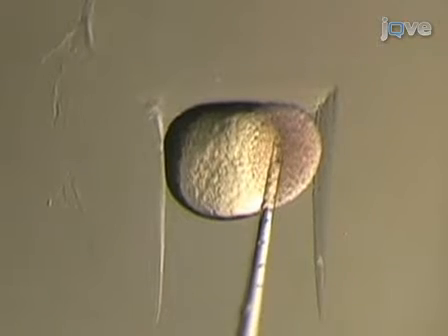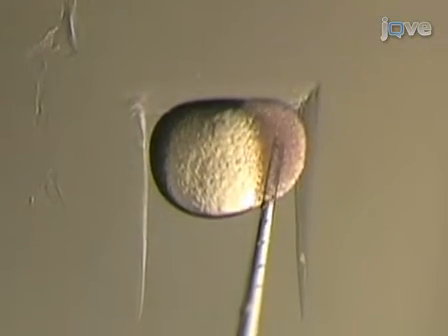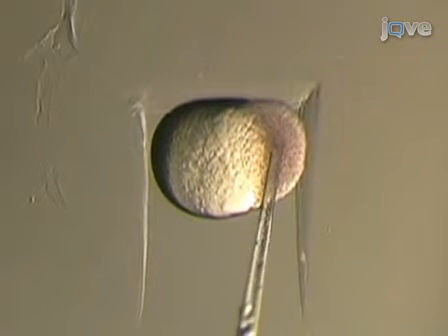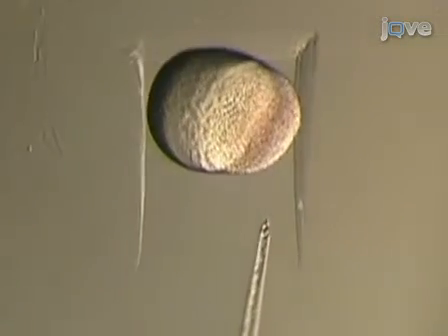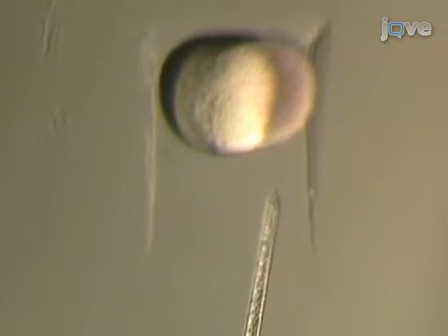Draw up donor cells slowly and carefully into the needle to avoid shearing the cells. Avoid taking yolk up into the needle. After the desired number of cells is taken up, reverse the pressure slightly to stop the suction and remove the needle from the embryo.